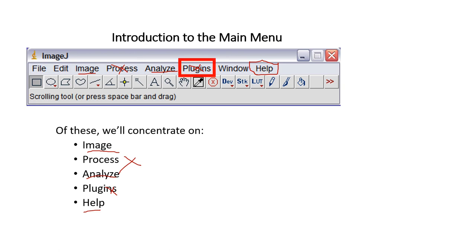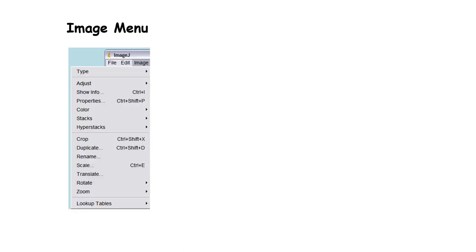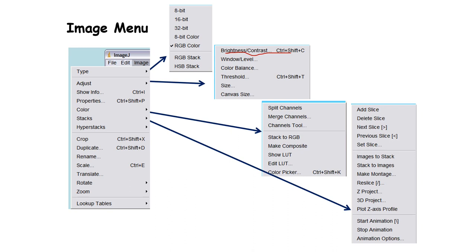Plugins can be very useful later, but at the beginning we are not going to use them. The Image menu you will use a lot — it has many things. For example, here you have the brightness and contrast, which can be very useful when you want to see things clearly. You can split channels, and I'll explain that in a second. You can also add a slice or delete slices, which we might use later if we accidentally duplicate some slices.